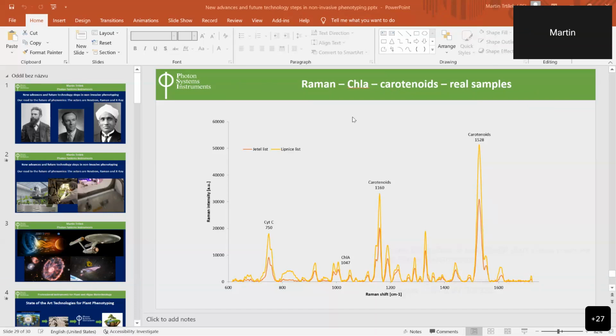If you are focusing on the absolute value, then what we always did was a chemical analysis to calibrate and understand what this amplitude in the signal means, because there are a number of effects: structure, morphology of the system, and so on. But for the comparison, it's easy, because you have the same conditions when you do the measurements, and you can easily compare if it's 2 times more or whatever.